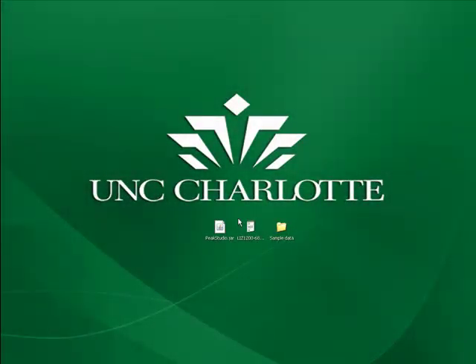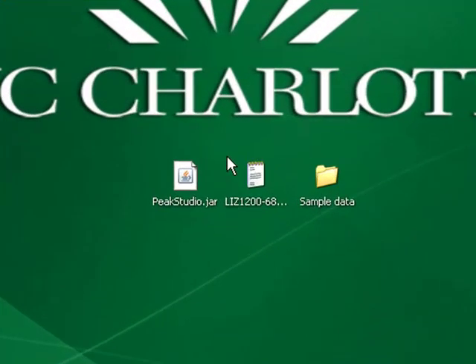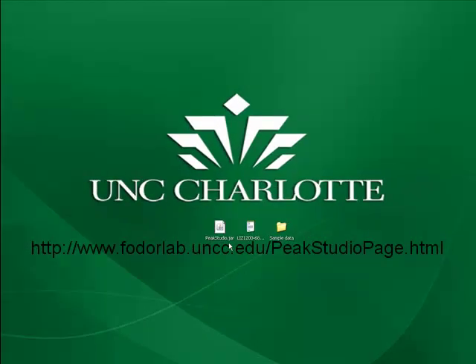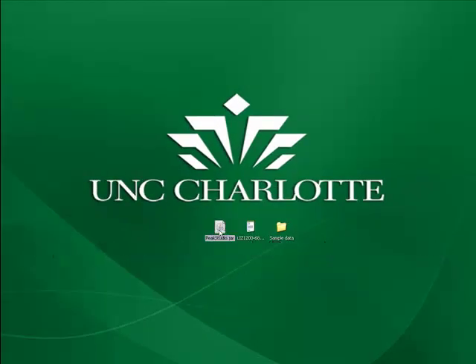I'm going to start by opening PeakStudio using the .jar or jar file, which can be downloaded at our lab website. Once you have the PeakStudio jar file, go ahead and double-click on it to open the program.